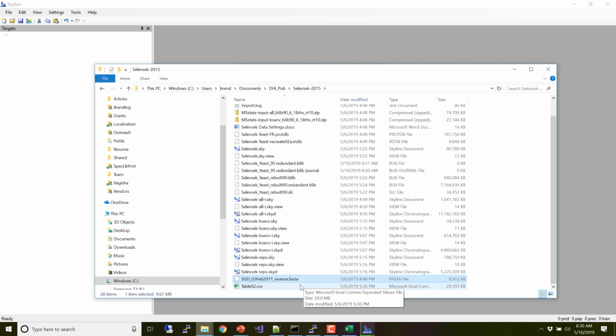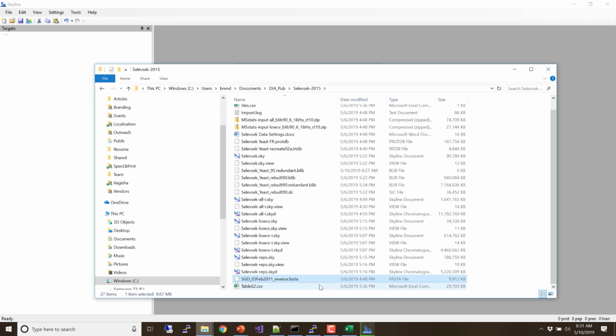I would like to be able to reproduce exactly the peptides that they were searching against, and there are several different reversing algorithms. The simplest one is just reversing the whole protein, but then they also do reverse peptide sequences, where you keep the cleavage points all the same, but you just reverse the peptides in place. And I think that's what they did.